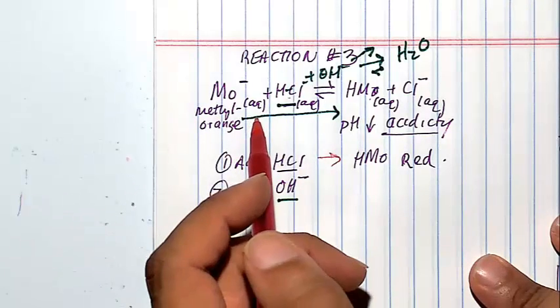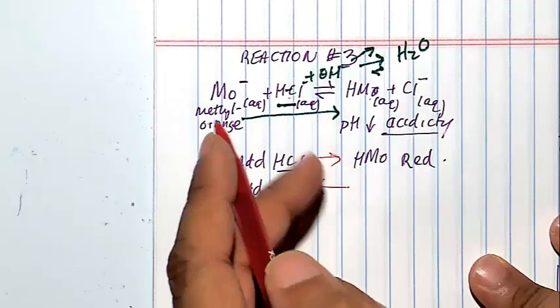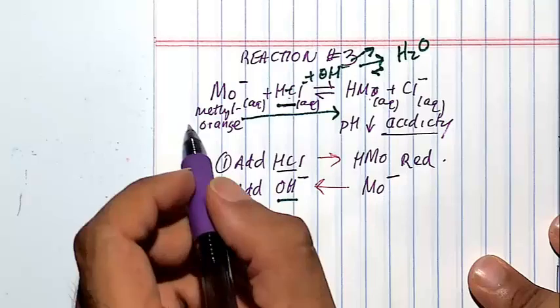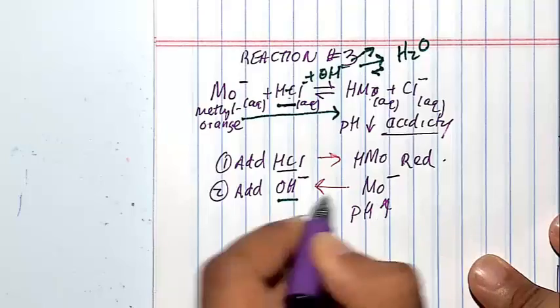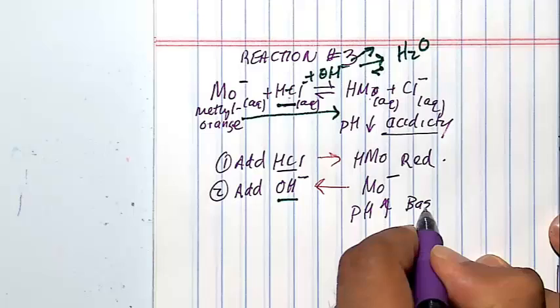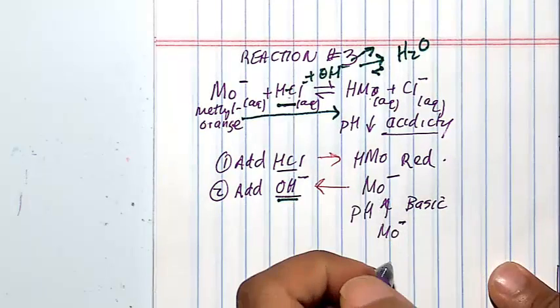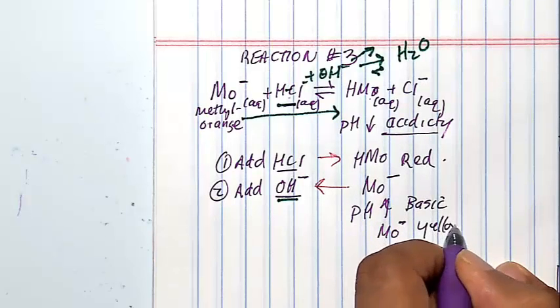What will the equilibrium do to counteract this effect? It's going to shift to make more HCl, so we would expect the production of MO-, the conjugate of HMO, to increase, and this has a methyl-orange yellowish color. So the pH is going to go up because the HCl is being neutralized. You have a solution that is more basic by virtue of the addition of the OH-, and MO-, the conjugate of HMO, has an orangish yellowish consistency, so yellow-orange.